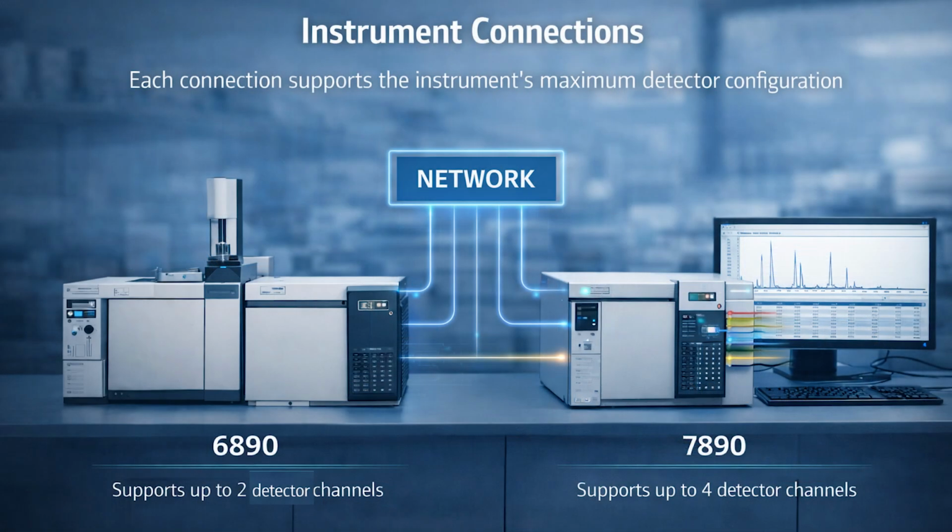Instrument connections. Under the current licensing model, each Chromperfect software license includes one instrument connection by default. An instrument connection allows Chromperfect to communicate with an instrument. Each instrument connection is supplied to support the maximum number of detectors that the instrument can be configured with.